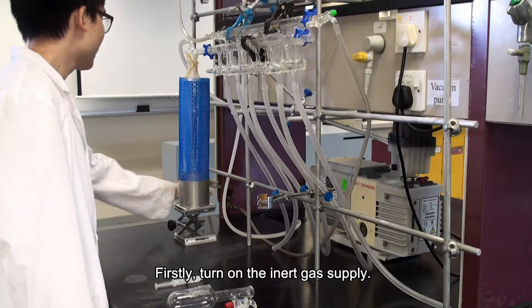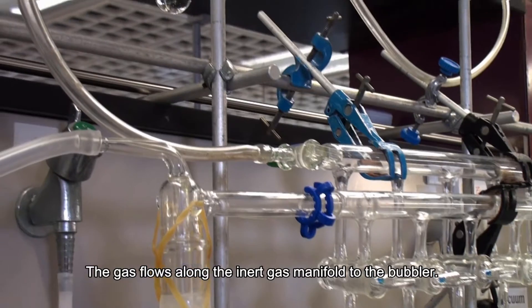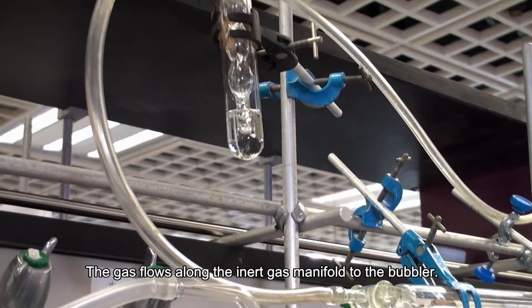Firstly, turn on the inert gas supply. The gas flows along the inert gas manifold to the bubbler.